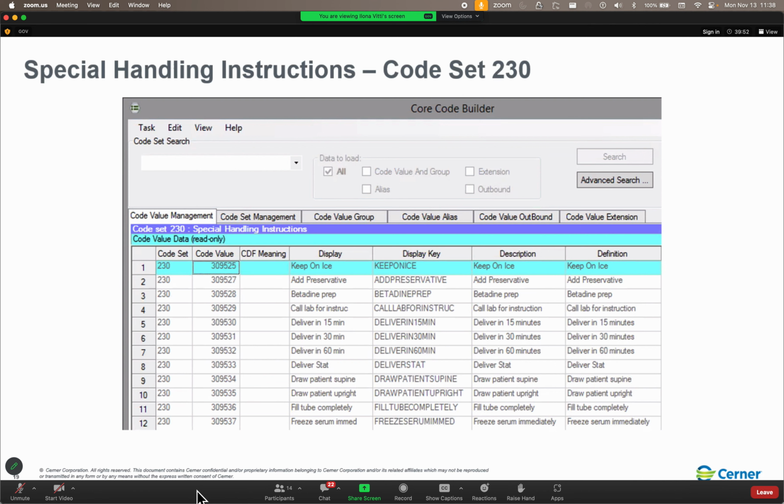Because when a physician places a laboratory order with an add-on collection priority, the laboratory staff takes the necessary steps to merge the order into an already collected container using collections resolution. And if they don't have a valid specimen, the lab can modify the collection priority of the order. They can set the nurse collect detail to yes. They can update the collection date and time of the order. So we can just add that order onto a future collection list instead of doing a cancel and reorder.